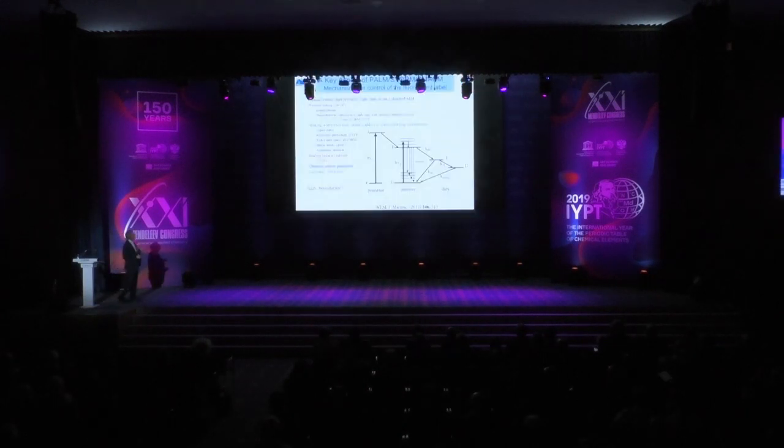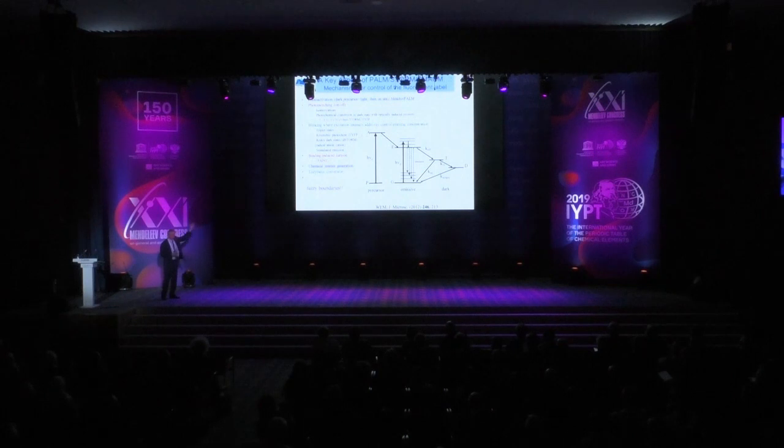So that's the idea. Now, as chemists, you want to think more about this process that lets us control the molecules, having them be on and off. So I won't look at the long list of mechanisms that have been demonstrated. Just look at these energy levels for a moment. Remember, we want to create a fluorescent object that you can pump and emit in the middle. That's what you want to create, but in low concentration. So one way to do that is to start with a dark precursor molecule, a molecule that's not emissive, but then maybe a little control light will convert a precursor into an emissive molecule. And if you do that at low enough optical intensity, you'll create just a few of those molecules at any given time.